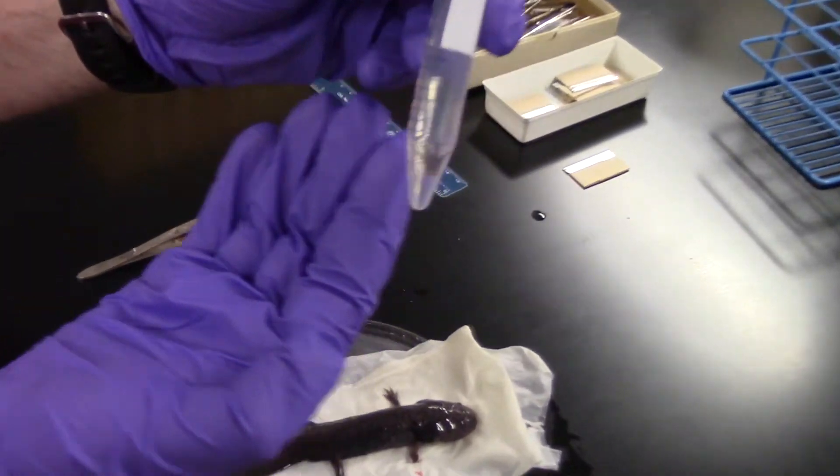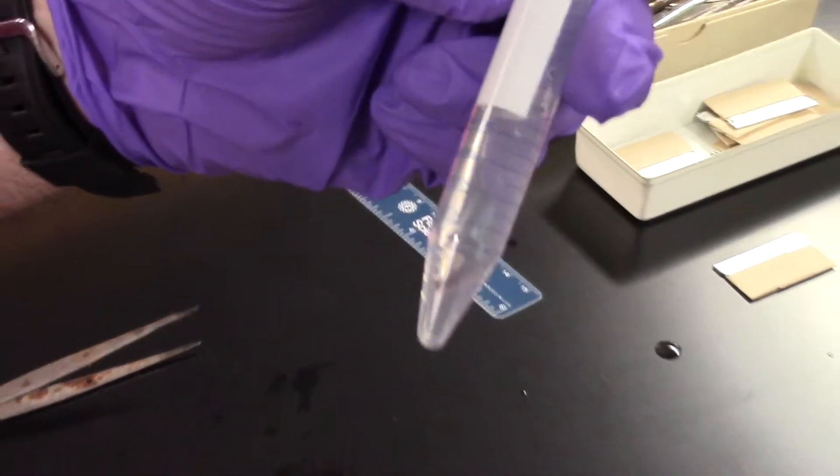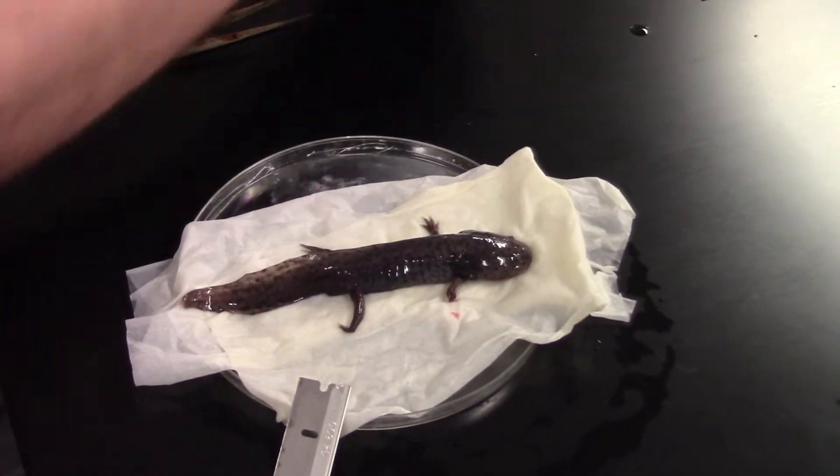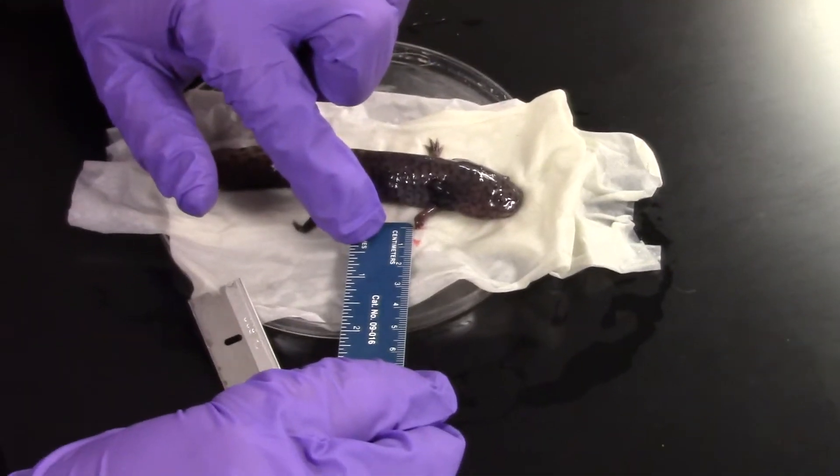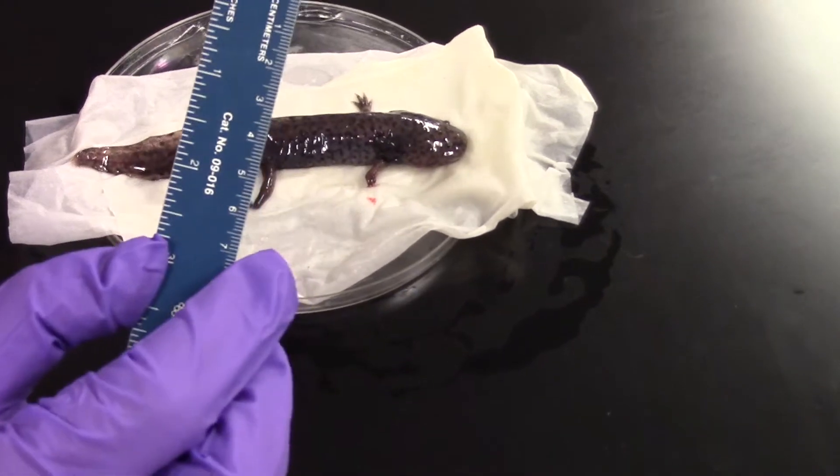So here we've got our limb with all the digits splayed out. Notice the animal still has not moved. It is completely anesthetized. Some of the things that we would want to do in a regeneration experiment is measure how much we removed. How long was the region that we removed?